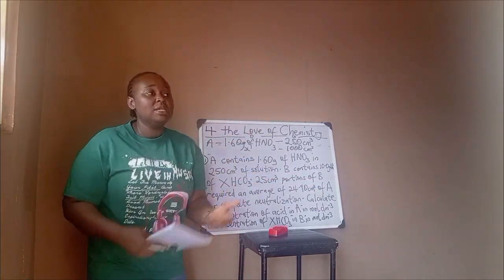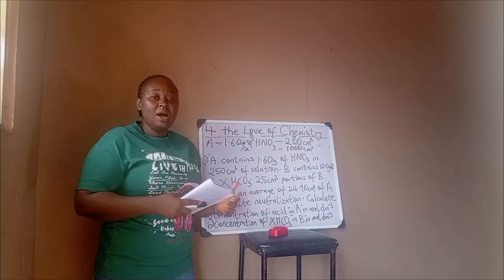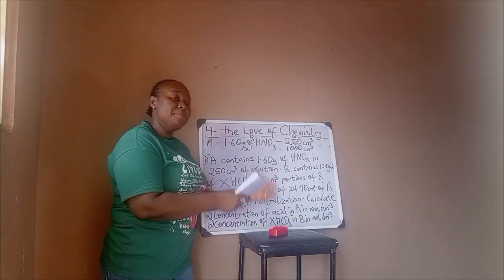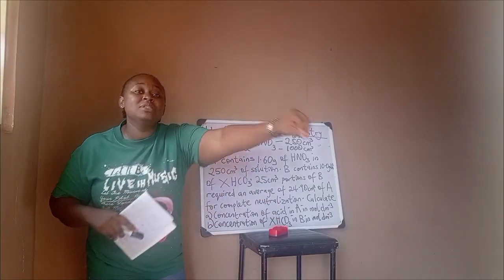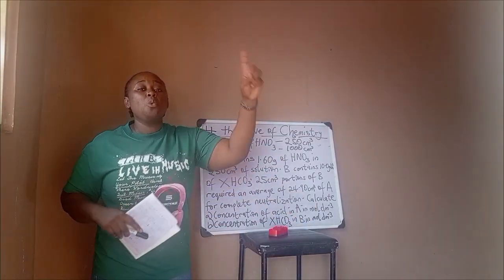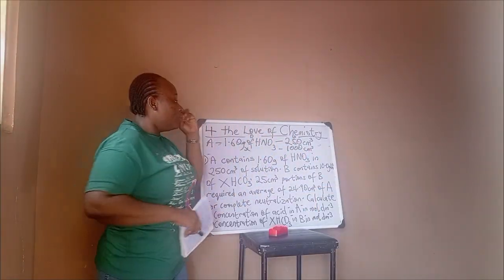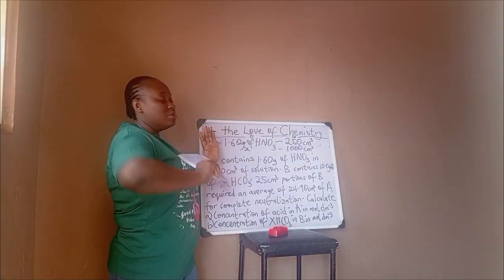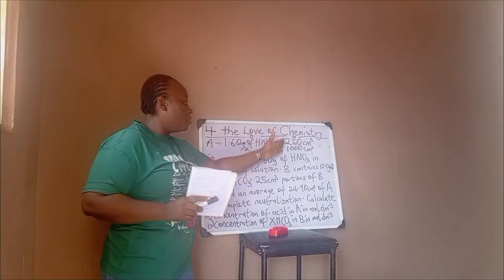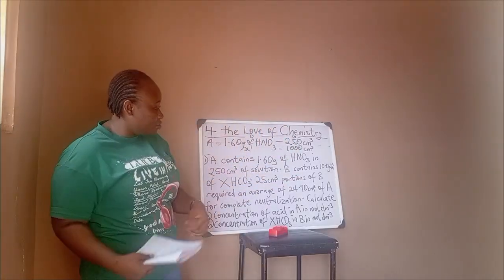250 is not our ideal concentration, because our ideal concentration for mass concentration is the amount in 1000 cm cube, or the amount in 1 dm cube, and 1 dm cube equals 1000 cm cube. So if this were 1000, that would have been our mass concentration, but because it's not in 1000, it is what we will use to get our mass concentration.